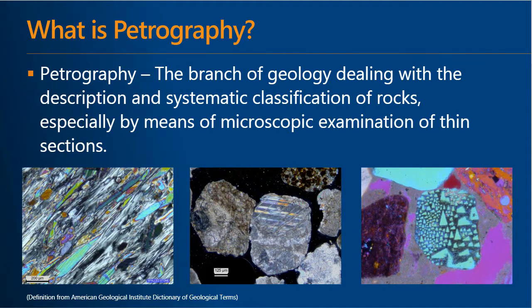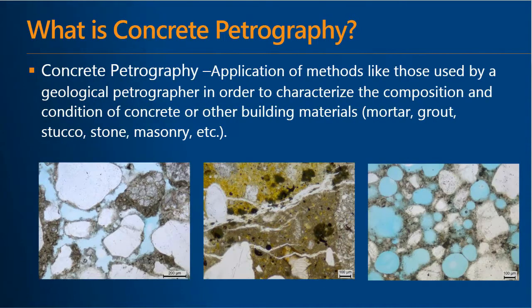Petrography originated as a branch of geology, and it originated simply as a classification of rocks through the use of microscopes. And over time, we've adapted that into the field of concrete petrography, which is a more specific form of petrography dedicated to the examination of building materials, such as concrete that we're going to go over today. So we use the same principles and the same ideas as geologic petrography. We use microscopes, and we just look at more materials than just stone.